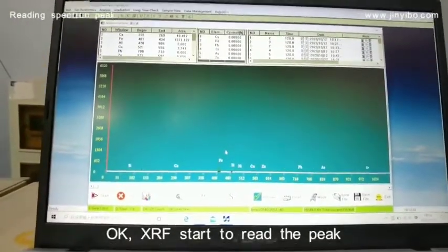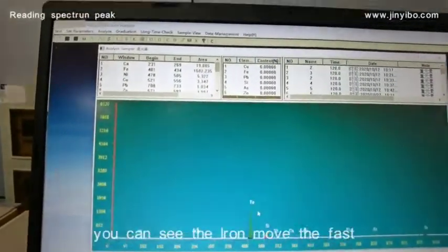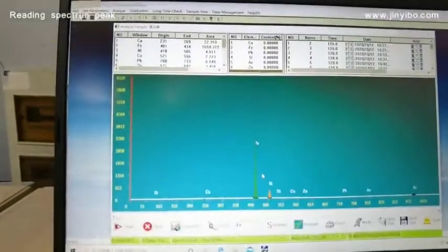XRF starts to read the peak. You can see the iron move very fast.